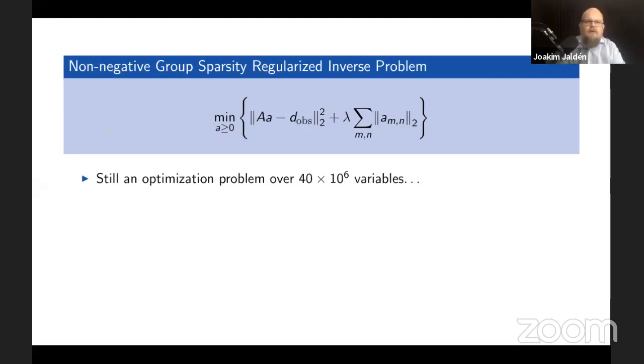Right. I mean, it's a quantity. So you count the number of spots, right? If you're interested in another protein, for instance, then you have a multiplex assay where you have antibodies for both proteins, and you image those at different wavelengths, right? So they would be separated. So how much you have of protein A or protein B would be obvious because they come in different images.